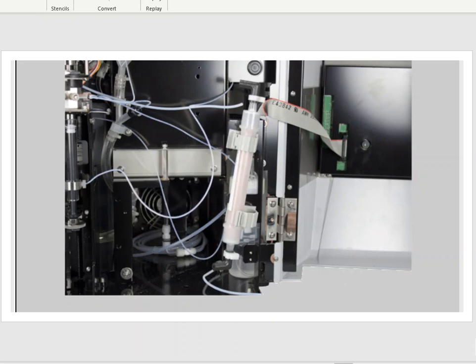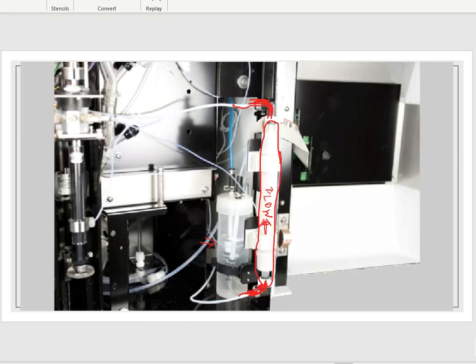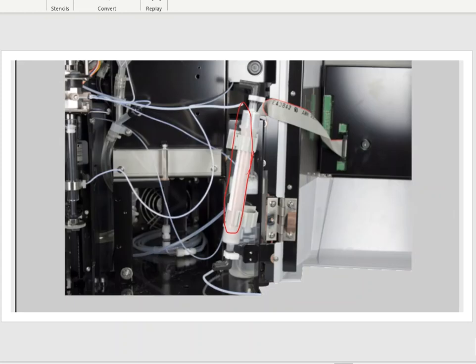So you unclamp the tubing and this whole entire piece will be removed, and you will purchase a new halogen scrubber, and the new halogen scrubber goes back on inside of the holders and it snaps back into place, and you just reconnect the tubing again. Once more, that new halogen scrubber will have a flow direction on it, and you want to make sure that you are installing it in the proper orientation or the proper direction.